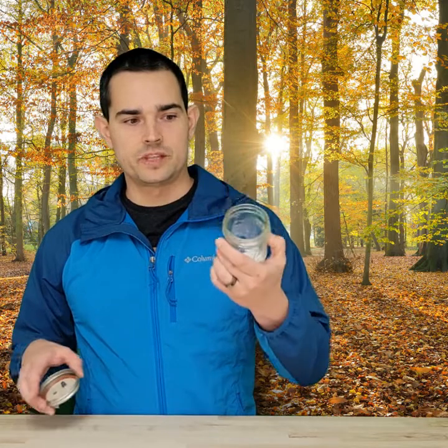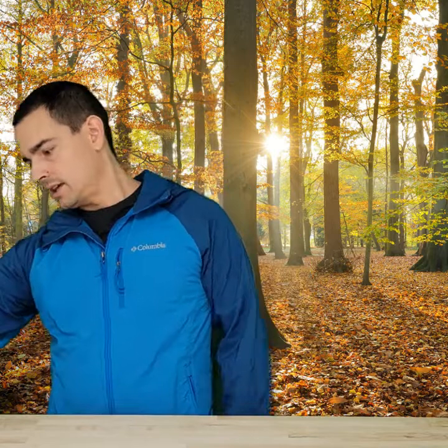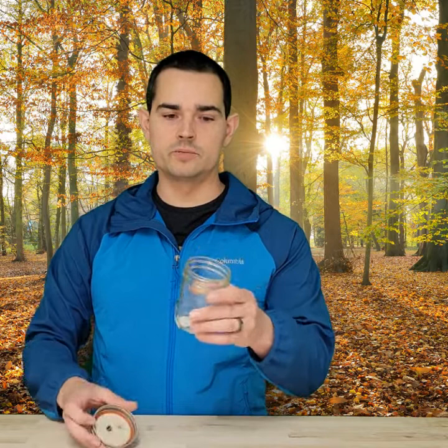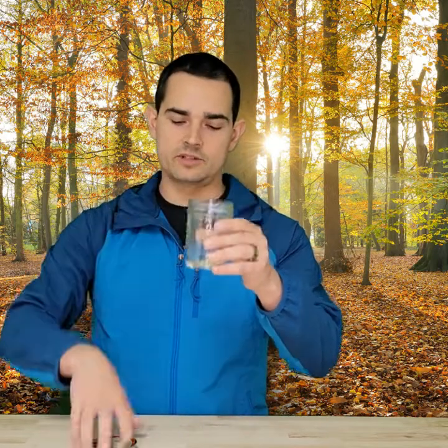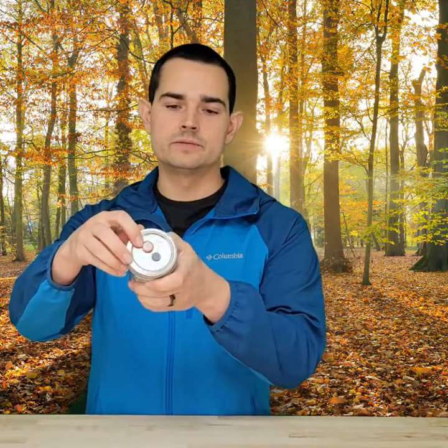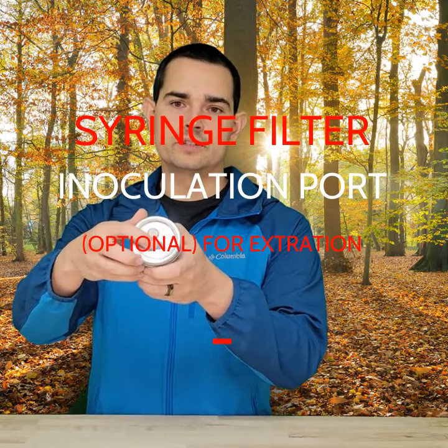For this particular half-pint jar size, an eighth of a teaspoon of light malt extract would be just fine. You can also use honey or other corn sugars — just keep it simple with whatever you have. Once you get the jar filled with your sugar and water base, fill the water up close to the top of the jar. Then cover it, making sure your top has a micron filter and an inoculation port.